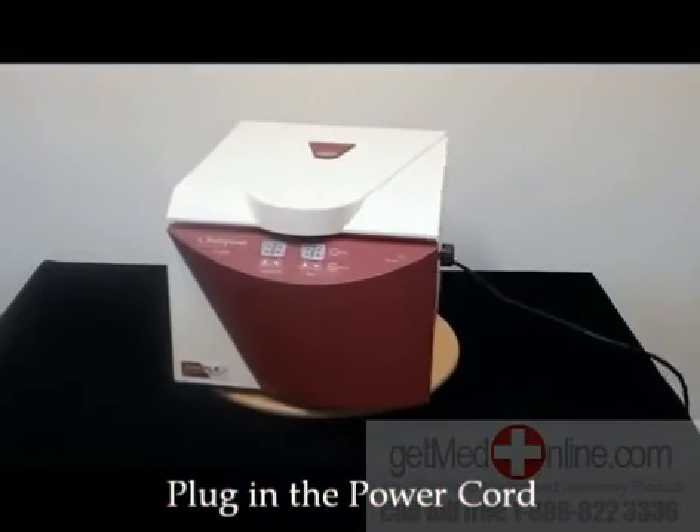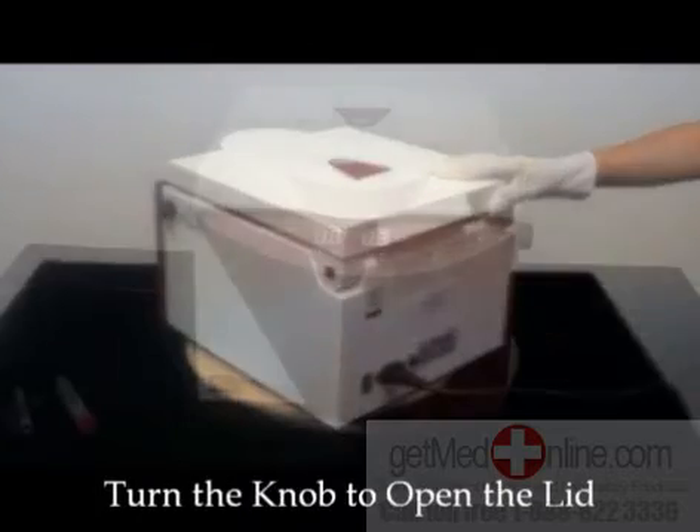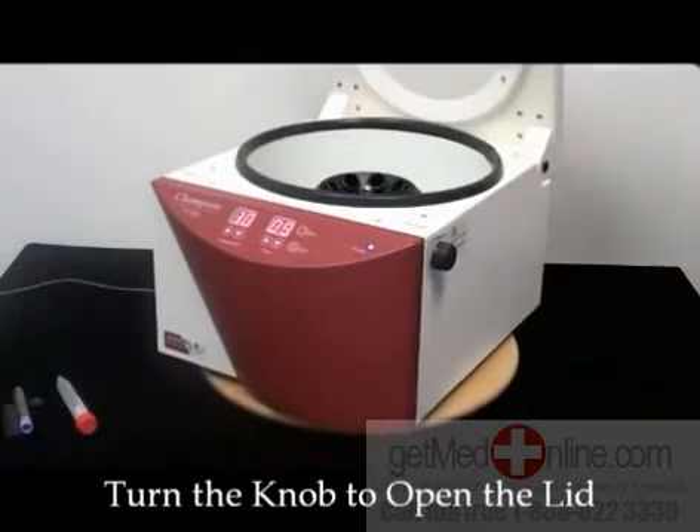Plug in the power cord and turn on the power switch located in the back. To open the lid, use the knob located on the right. Twist towards the back of the machine and the lid should pop open.